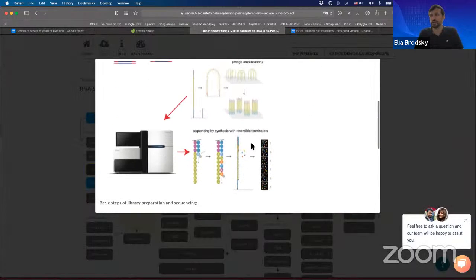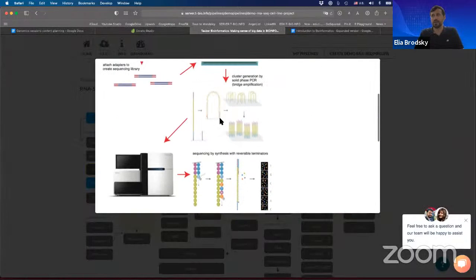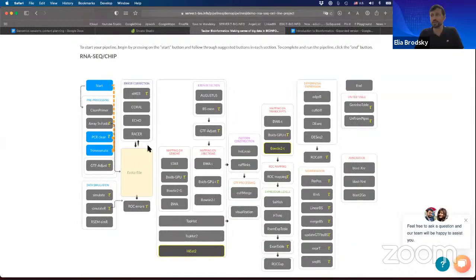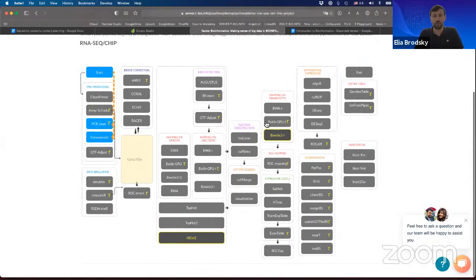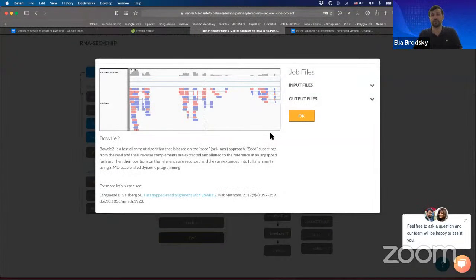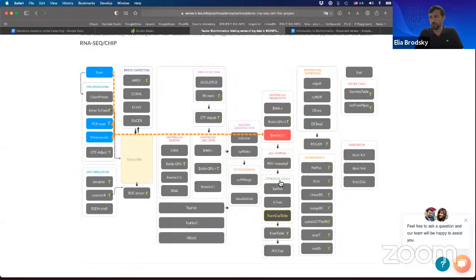After we click on Trimomatic, we have another one pop up, which is called PCR Clean, which addresses the step of bridge amplification. We'll talk a lot more about this in our next session. And after we've done some pre-processing, we now have mapping on transcripts. Essentially, we're going to map those reads onto a reference transcriptome. And then we will produce a level of expression or quantification.